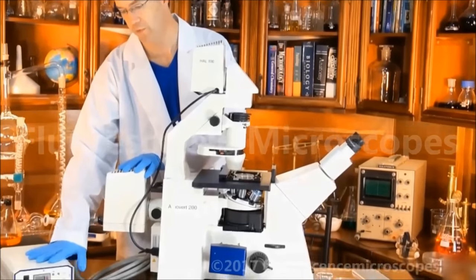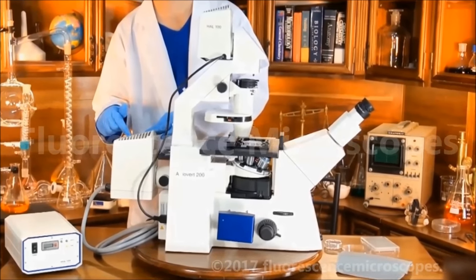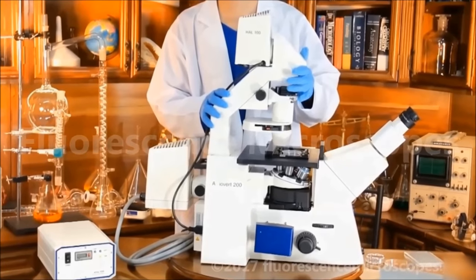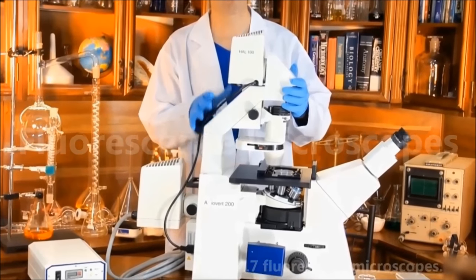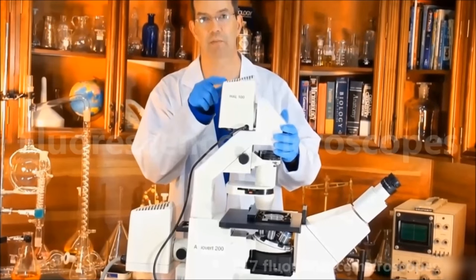This is the transformer, this is the lamp housing, and the mercury bulb is inside the lamp housing. It has a 100 watt upper transmitted light halogen. This is the 100 watt halogen lamp housing with the bulb inside.